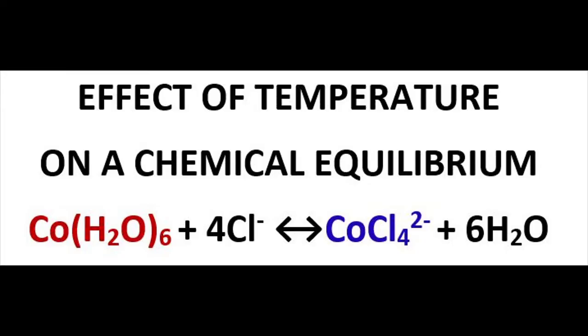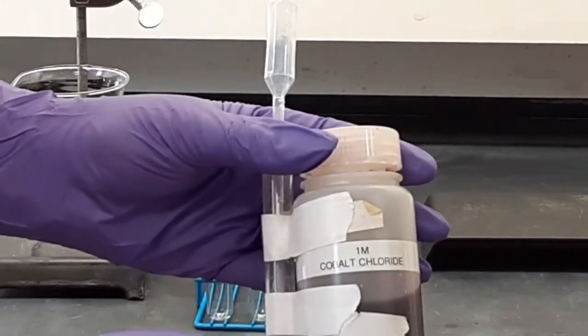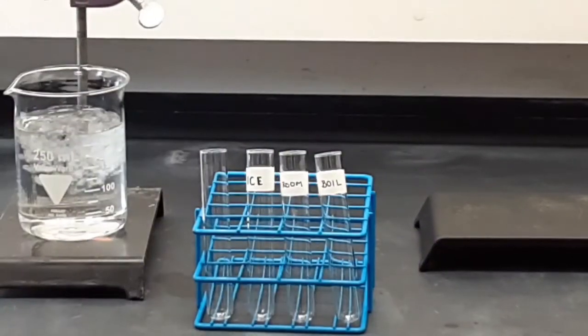This final segment is mostly about temperature, but we're going to make some concentrated cobalt tetrachloride as a standard for comparison, and we're going to do that by using hydrochloric acid in its full concentrated strength. It's quite dangerous, and we'll explain that as we go along here. So first, the cobalt chloride. As you saw, it's kind of pinkish, reddish perhaps.